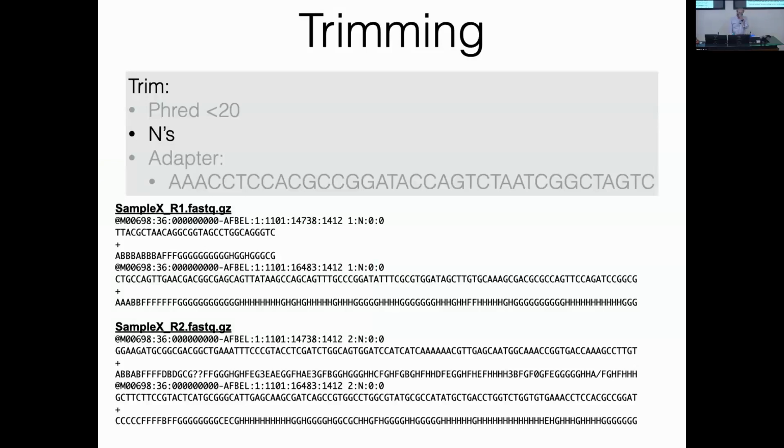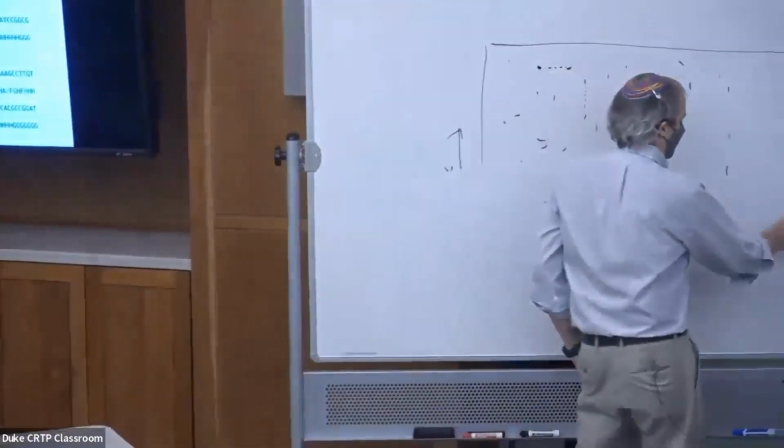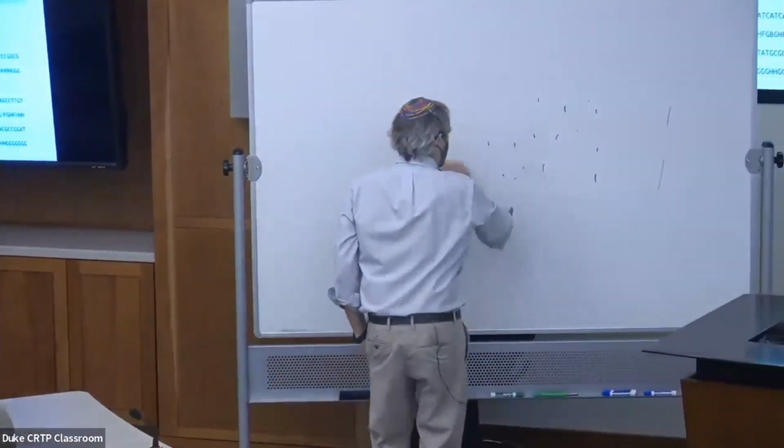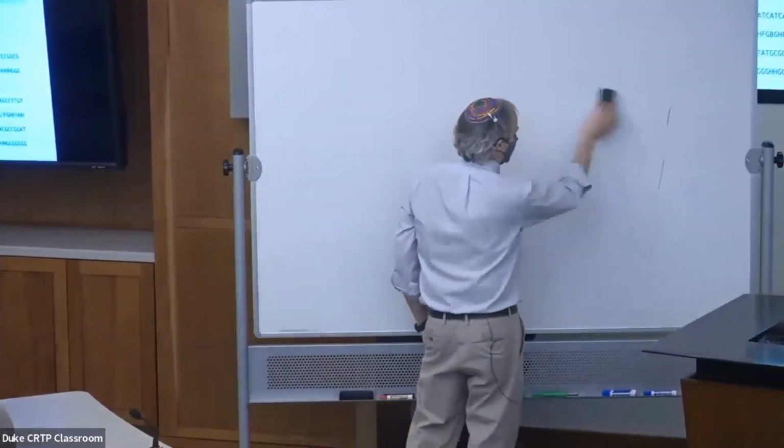So why does it tend to start off that way? Okay, yeah. That's just a function of the Illumina sequencer. It could be that there's an explanation out there, but I can give you my hand-wavy explanation that I think is probably pretty reasonable.